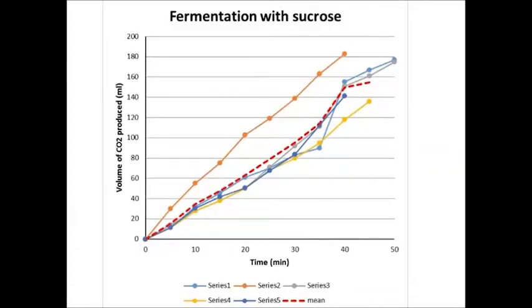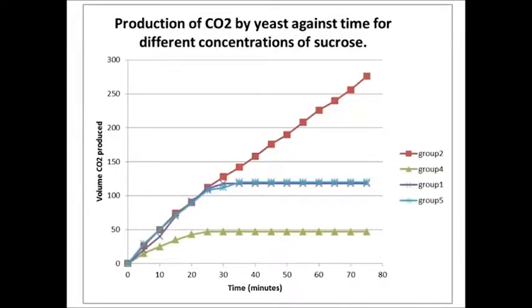The results of the first laboratory looking at the production of carbon dioxide with time are shown here. The class was divided into 5 groups in order to demonstrate reproducibility. As you can see, the results are very similar across the groups. We then asked the question, how much CO2 is produced by a given amount of sucrose? We explored this in the second laboratory, in which we carried out the same experiment using different amounts of sucrose. The results of this laboratory are shown here.